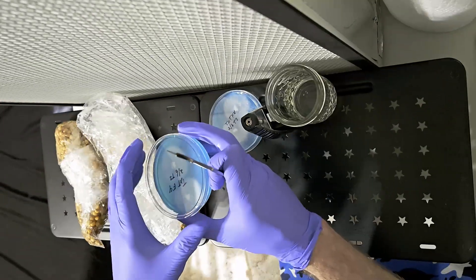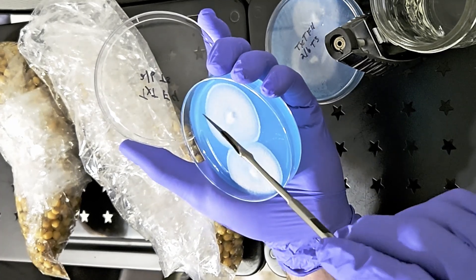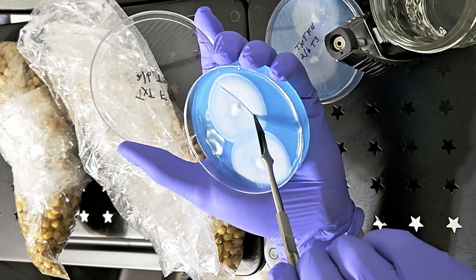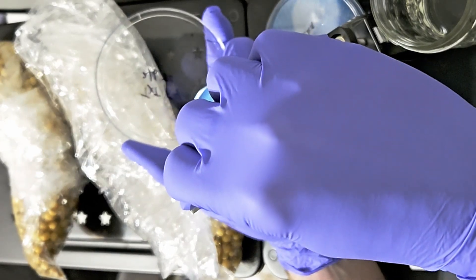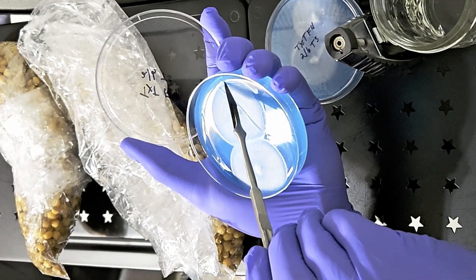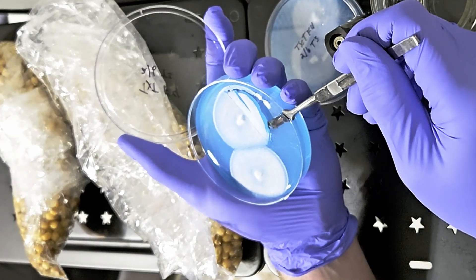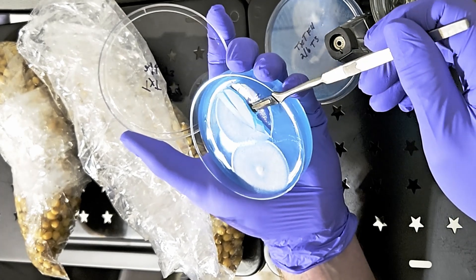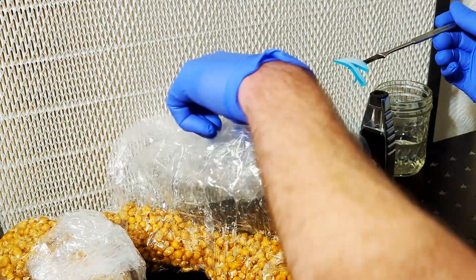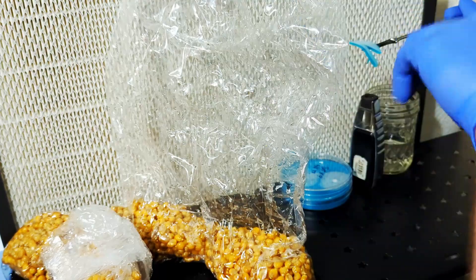We'll start by flame sterilizing the scalpel. Once the scalpel cools off, we can begin. While still holding the scalpel, open the plate with both hands, using the hand not holding the scalpel to hold the lid. We're going to select some clean mycelium to inoculate the popcorn with. You really don't need a lot of mycelium. Try to get mycelium closest to the edge of the culture, and avoid the old transfer pieces. Try to avoid touching any part of the plate with the scalpel. Make sure the pieces you cut out are easy to pick up and cut all the way around so the agar is easier to remove. If the mycelium falls off, do not try to pick it up and use it — you have to get a new transfer.